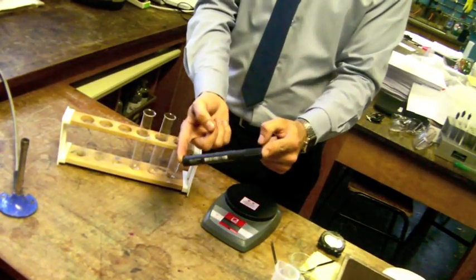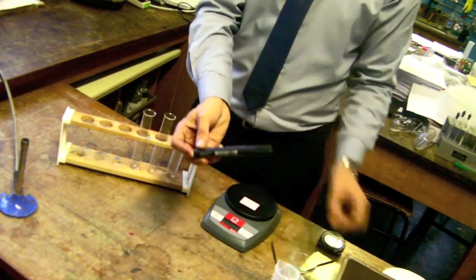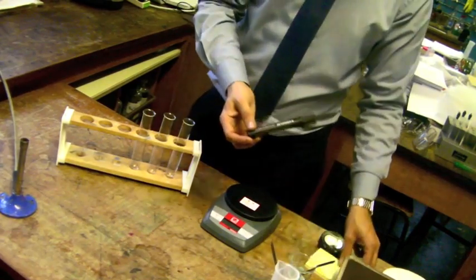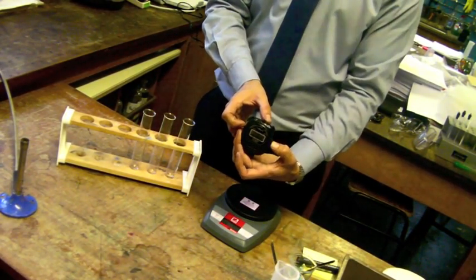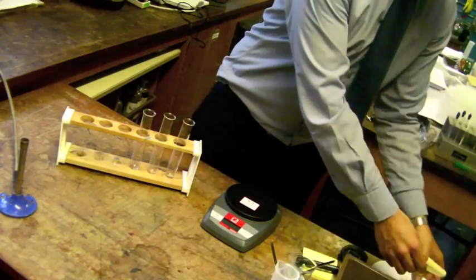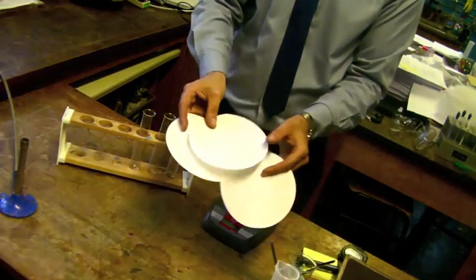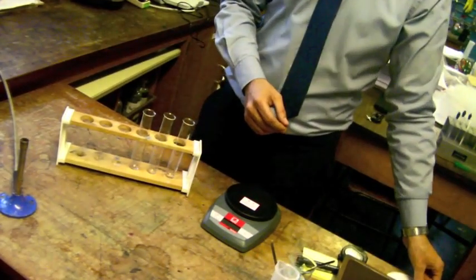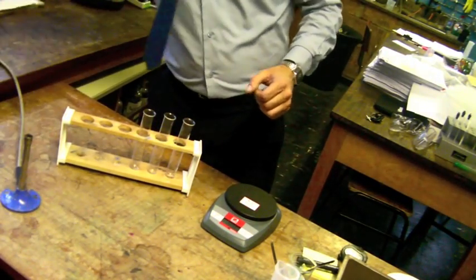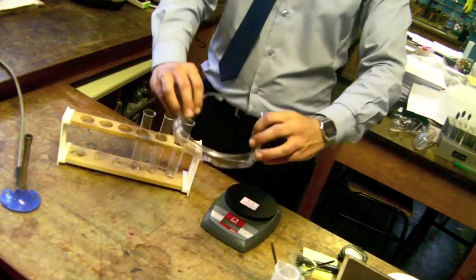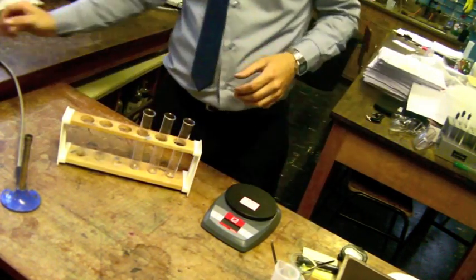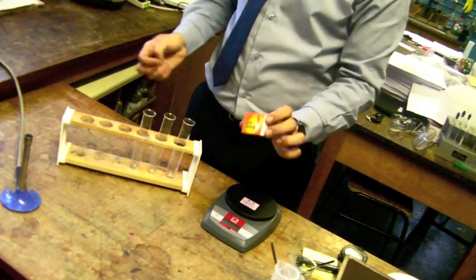You will also need a black marker pen and a sticky note to draw on, a stopwatch timer to time your experiment and three pieces of filter paper. Let's not forget goggles to protect our eyes and a box of safety matches.